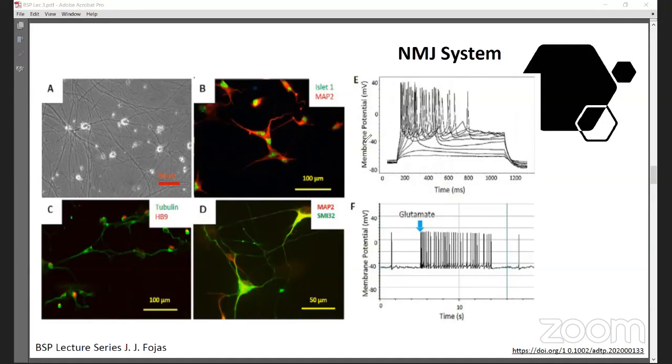Those are actually patch clamp recordings from the differentiated neurons at day 27. So I've also tried to develop this patch clamp method, but it's quite complicated. A little movement with patch clamp recordings would give you different recordings, so you have to make it really stable. This one, they did it at day 27. They demonstrated repetitive firing during current clamp, indicating, of course, excitability.